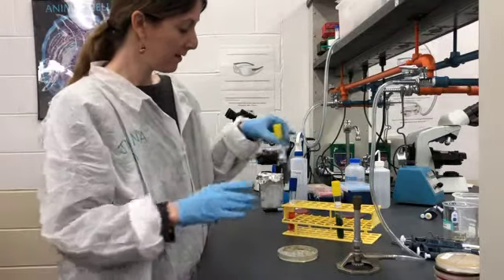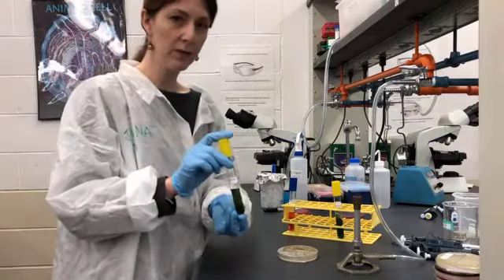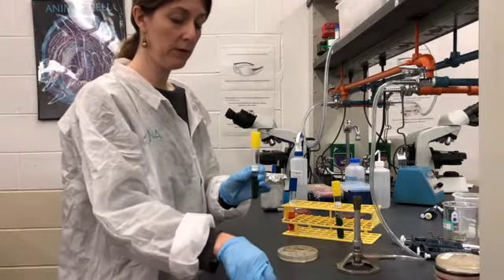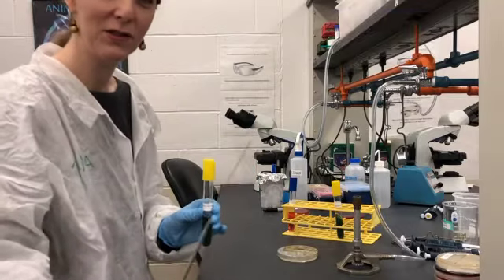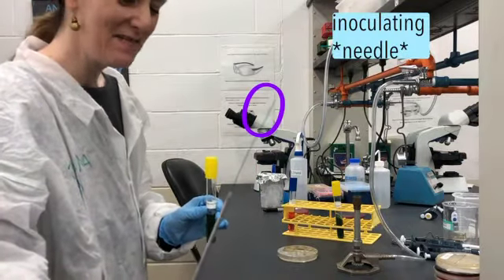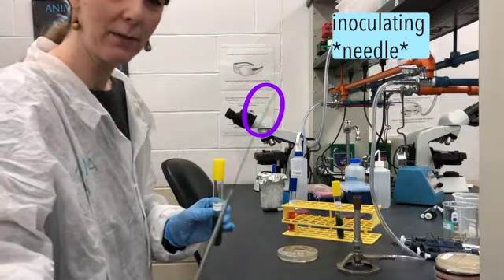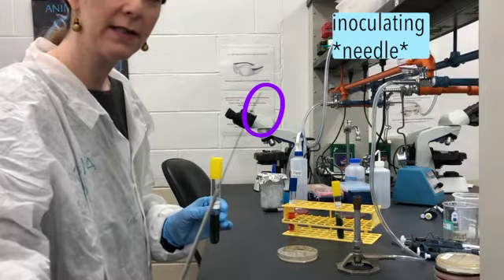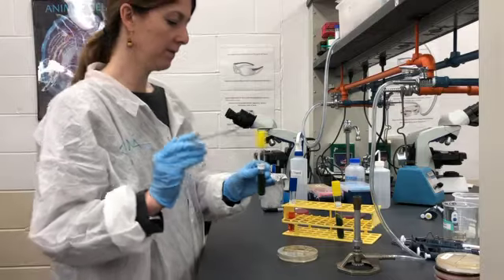Okay. Next up, we have the semi-solid media. So we're going to be using this for the OF glucose, and we're going to move away from using our loop, and instead we're going to use a needle. Not sure if you can see the needle, but it looks like the loop. It's identical to the loop, the handle, the metal that is used, but you'll notice at the very end there's no loop. It's just a straight needle.